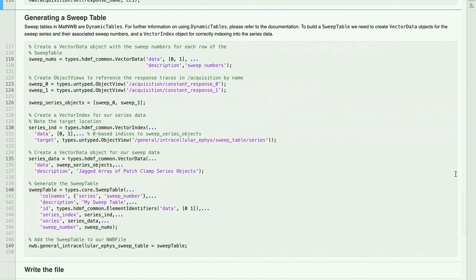To group our patch clamp series, we need to generate a sweep table. In MatNWB, sweep tables must be created by the user and added to the NWB file structure manually. Sweep tables are a dynamic table in NWB, and these allow custom columns to be added with additional sweep-level metadata if desired. For further information on customizing dynamic tables, you can refer to the documentation.